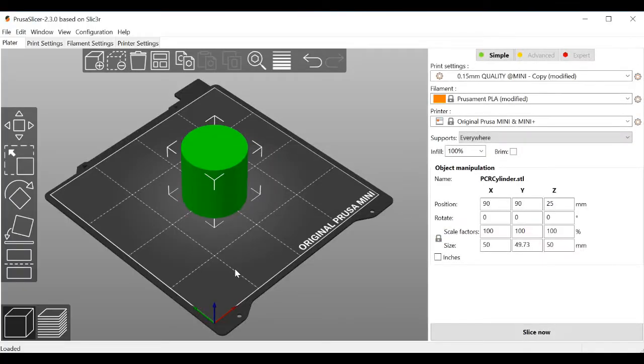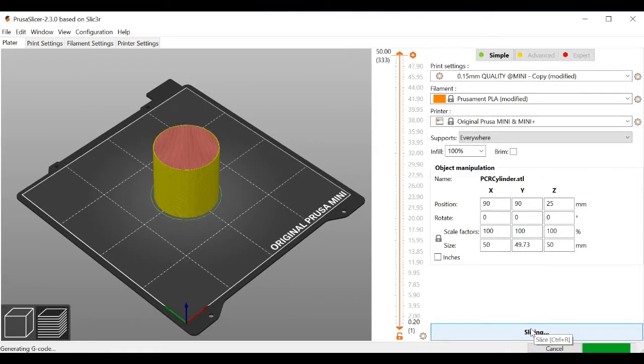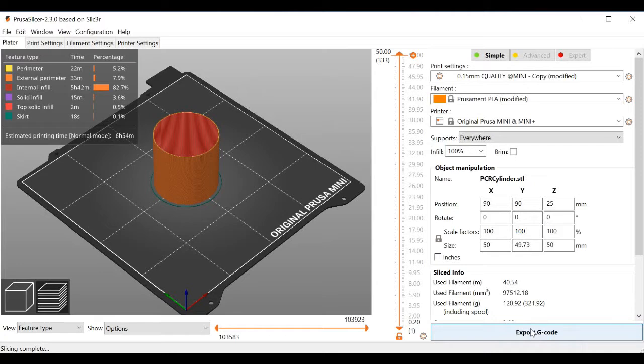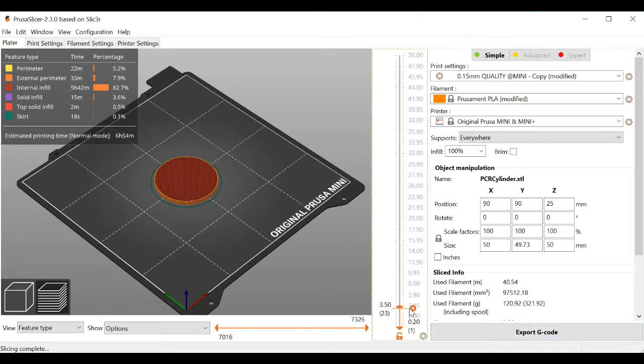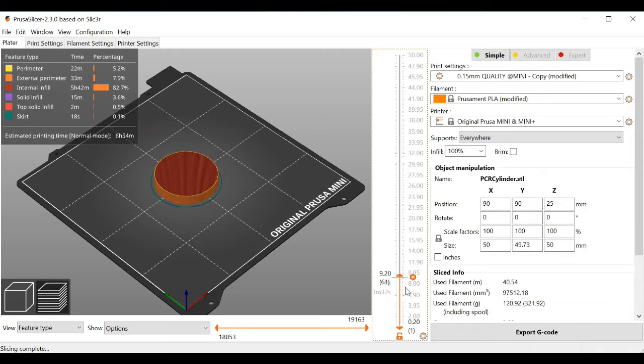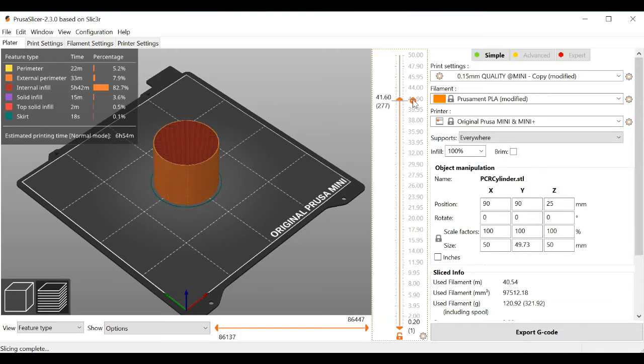The process is actually fairly simple. If you try it yourself though, make sure to remove the filament from the extruder first. Then, you'll want to load a simple 3D object into Prusa Slicer. The shape doesn't really matter, but a simple cube or cylinder like the one I used is probably easiest.